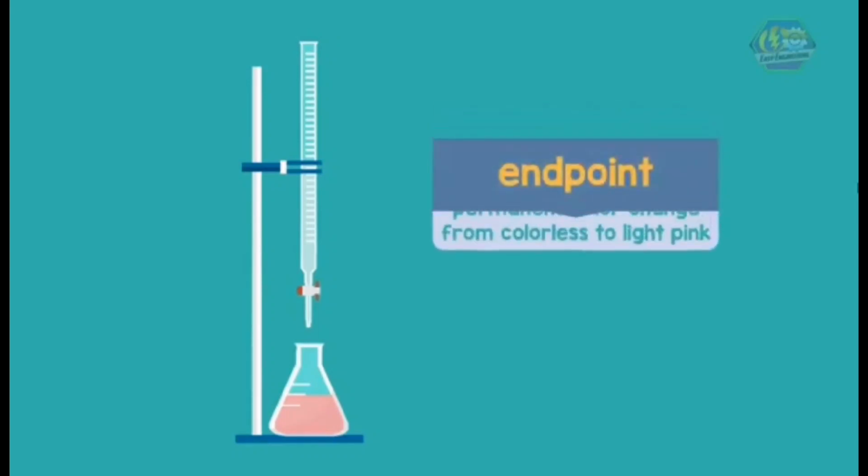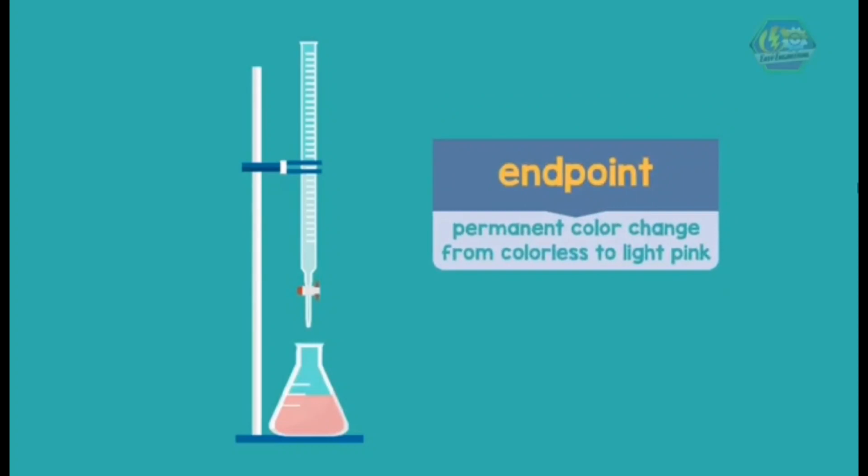The endpoint is a permanent color change from colorless to light pink. When we put more sodium hydroxide exceeding the endpoint, our solution shows overrun.